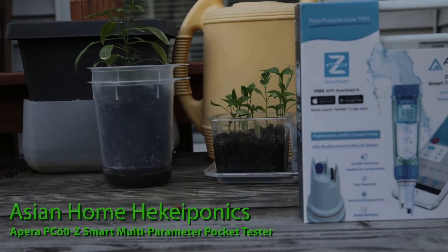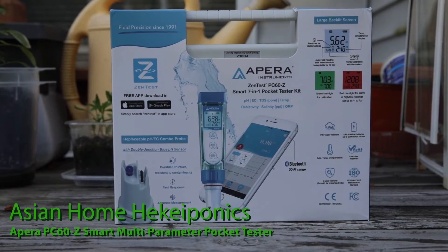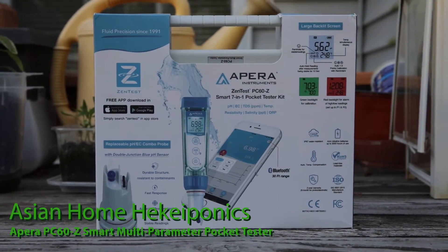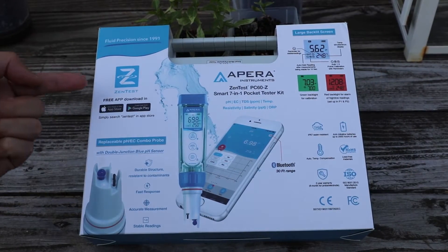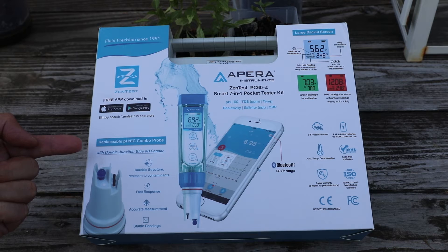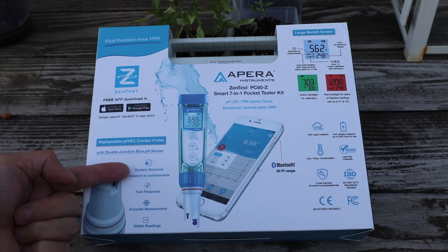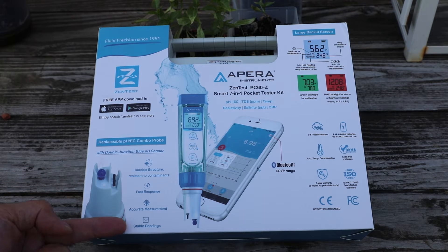Today I'm presenting an Apera Instruments ZenTest PC60-Z Smart 7-in-1 Pocket Tester. This device is loaded with stuff: a smartphone app, replaceable pH/EC combo probe, durable structure with resistant to contaminants, fast response, accurate measurements, and stable readings.